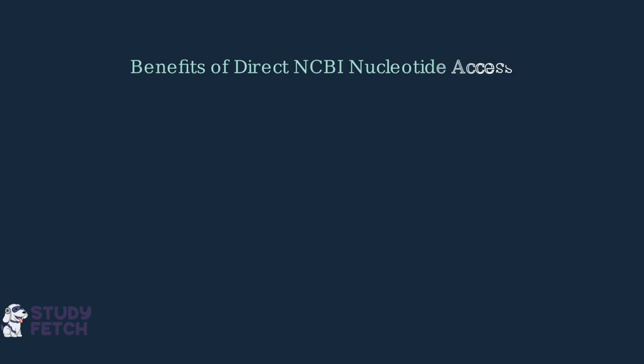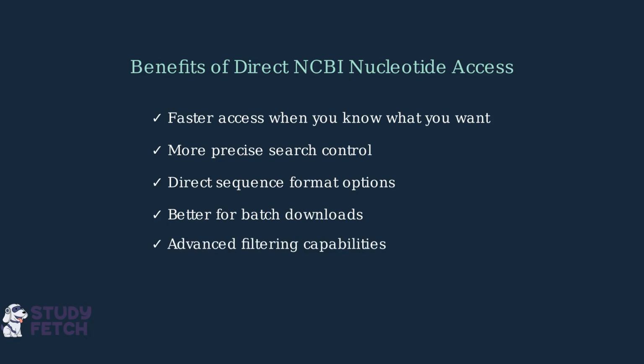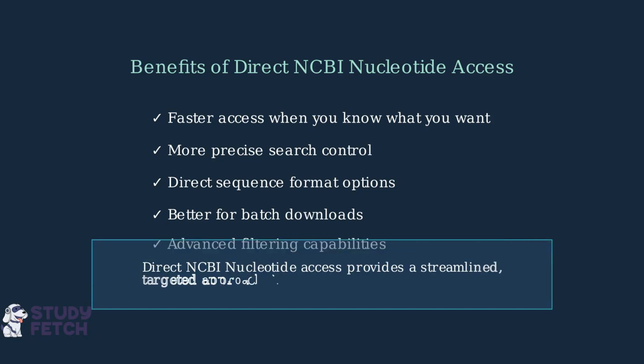Let's compare the benefits of direct NCBI nucleotide access. Direct access to NCBI nucleotide offers several advantages for targeted sequence retrieval. This direct approach is particularly valuable when you need precise control over your sequence searches. Next, we'll explore another powerful tool for sequence retrieval.